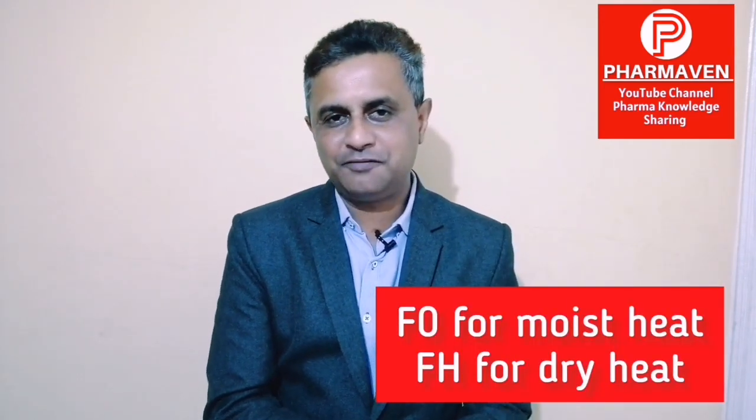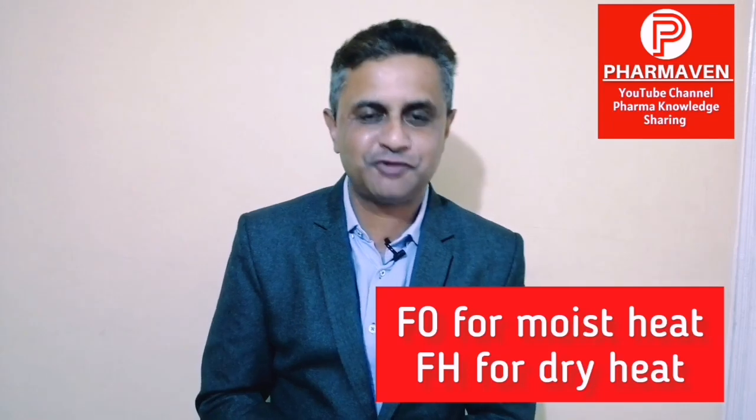Now let us hope this is clear. Now let us understand what is F value or F0 value. There is a specific kill pattern. Microorganisms are getting killed not only when they reach 121. The killing starts, vegetative bacteria will start getting killed at 80 degrees. So what is the overall exposure? What is the overall heat transfer to the microorganisms? It is calculated as F value or F0 value. For moist heat we use the term F0, for dry heat we use the term FH value.